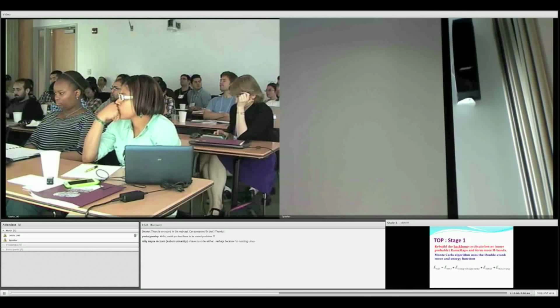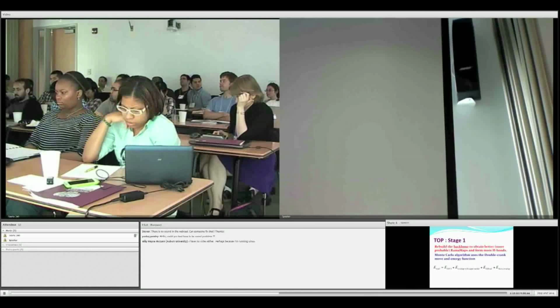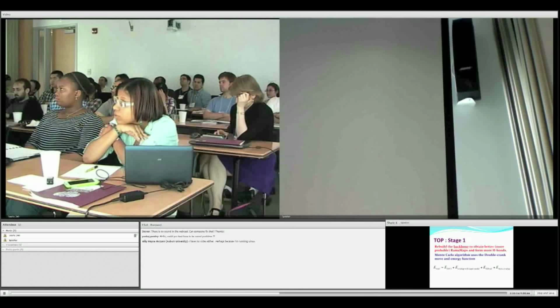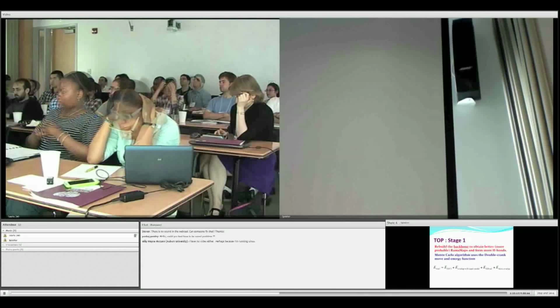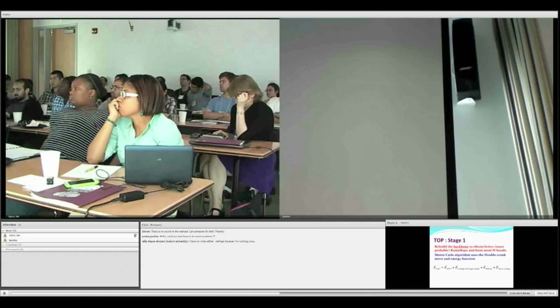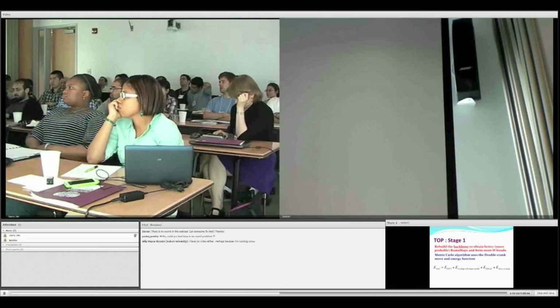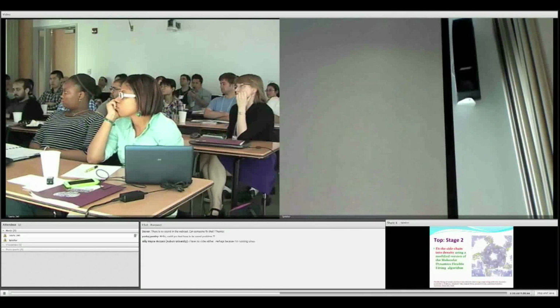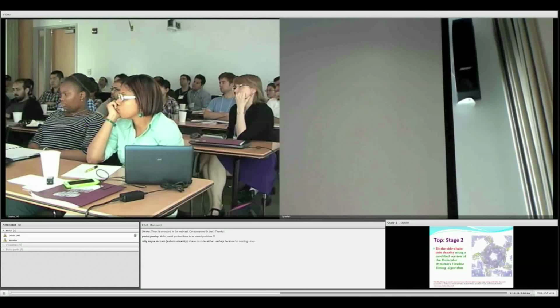We have two things: the TSP scoring, the way I explained it, and also this novel moveset, put into a Monte Carlo simulation. So the stage of the refinement, as you tried it yesterday when you went to the website, is basically a Monte Carlo algorithm that tries to optimize the energy function based on the TSP3, based on the overlap with the input model. We try to keep as close as possible to the starting structure. In the same process, we would also like to improve the hydrogen bonds.